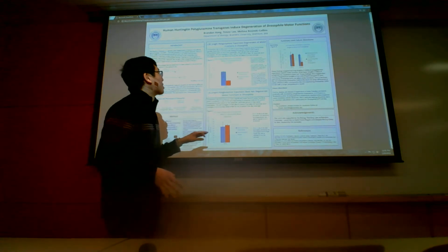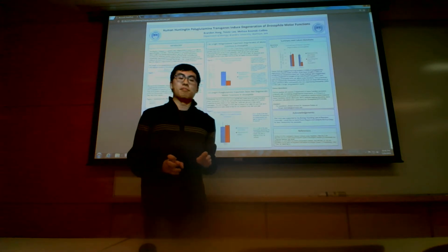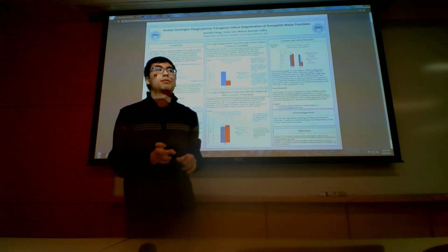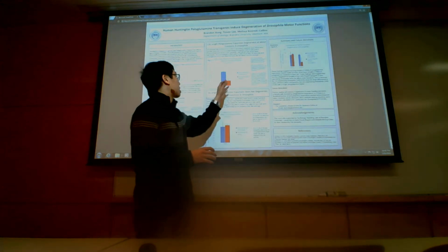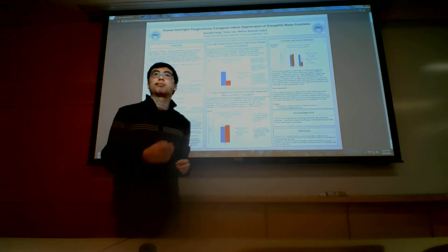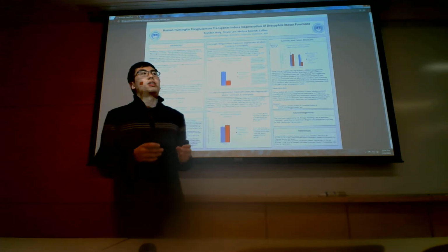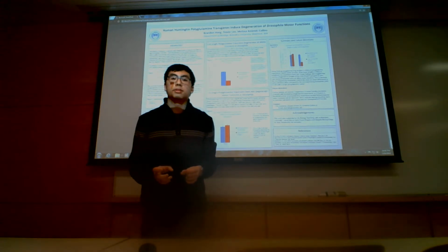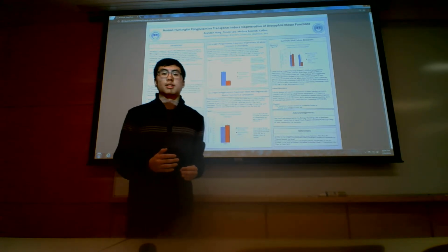Now, you may also notice that the error bar is a little large, and that's because of the way we calculated error. The way we calculated error was the distance from the average. In one replicate for this experiment, in red, the expression of the 128 polyQ repeat in Drosophila, about 48% of the Drosophila were able to migrate 8 centimeters in 30 seconds.